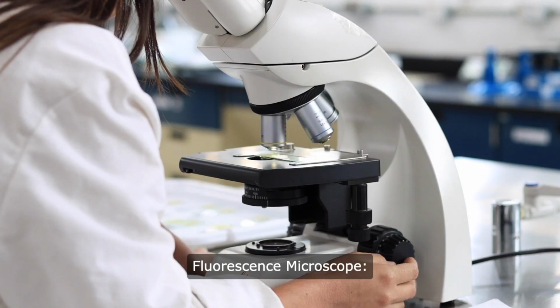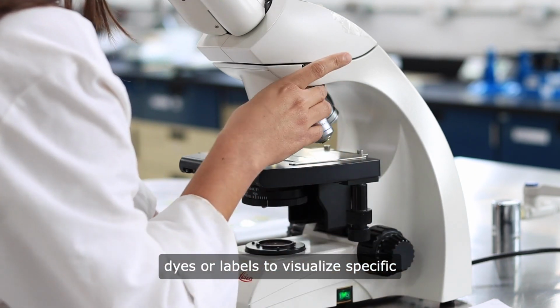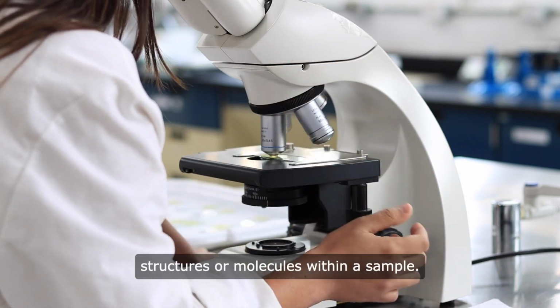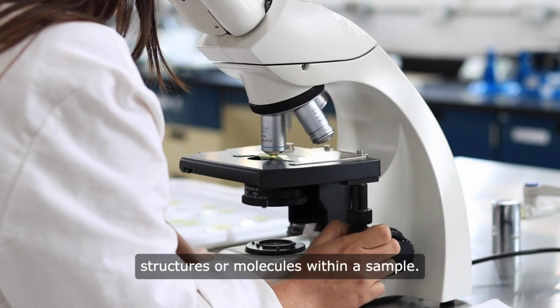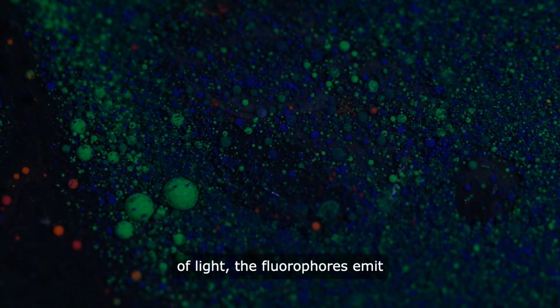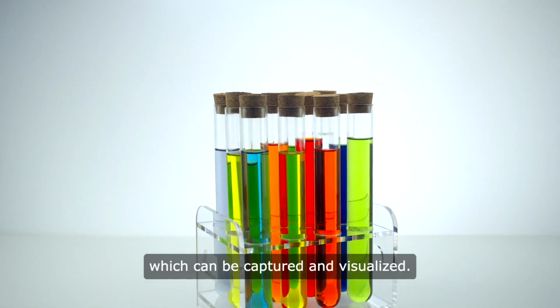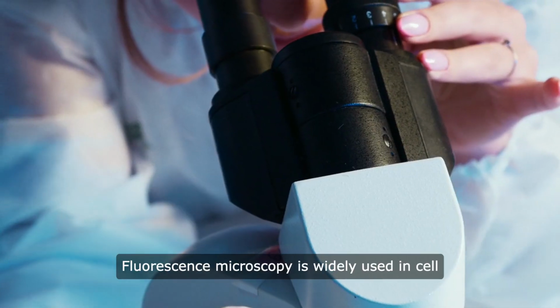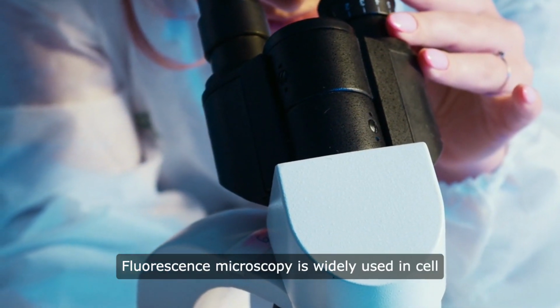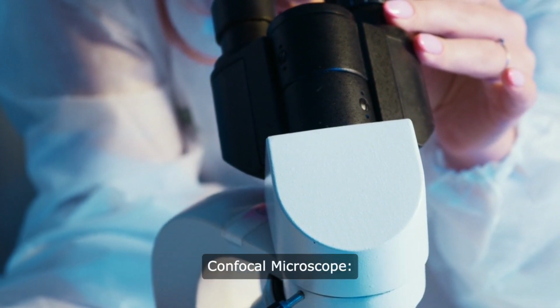Fluorescence microscope. Fluorescence microscopy uses fluorescent dyes or labels to visualize specific structures or molecules within a sample. When illuminated with a specific wavelength of light, the fluorophores emit light of a different wavelength, which can be captured and visualized. Fluorescence microscopy is widely used in cell biology, immunology, and molecular biology.